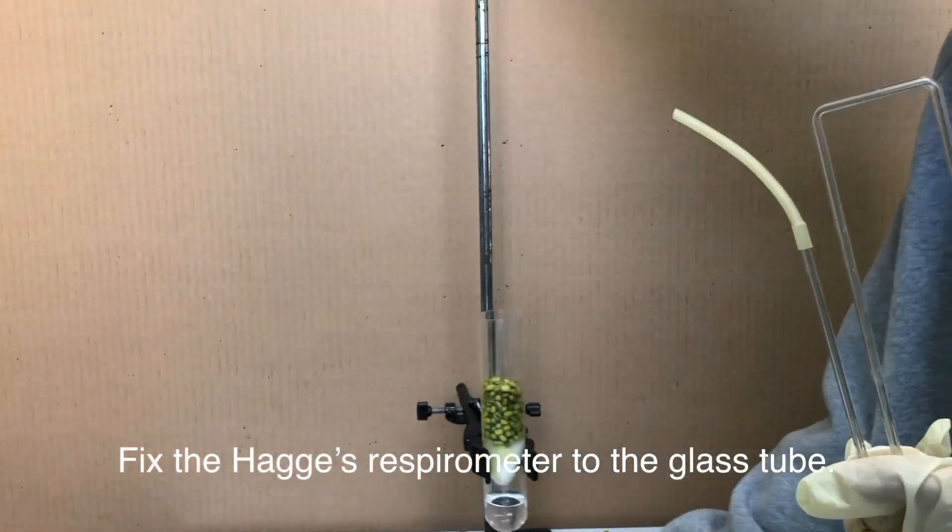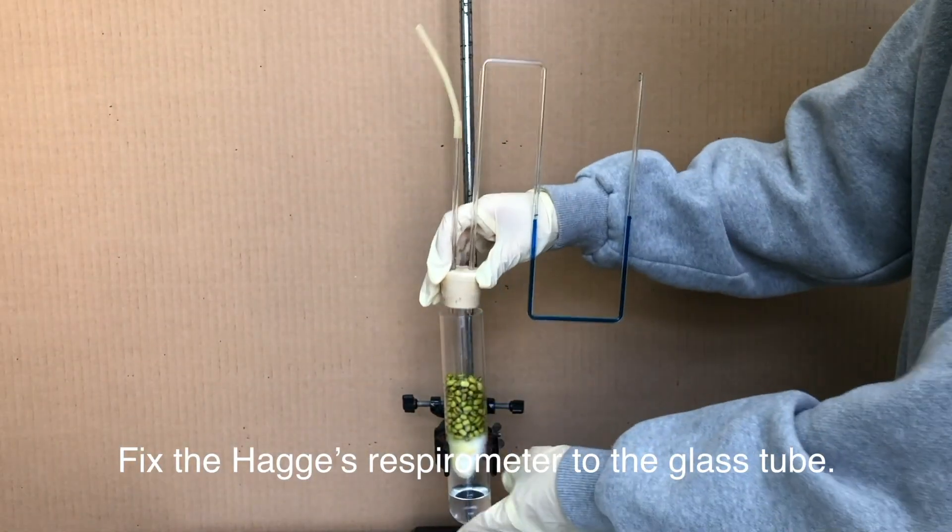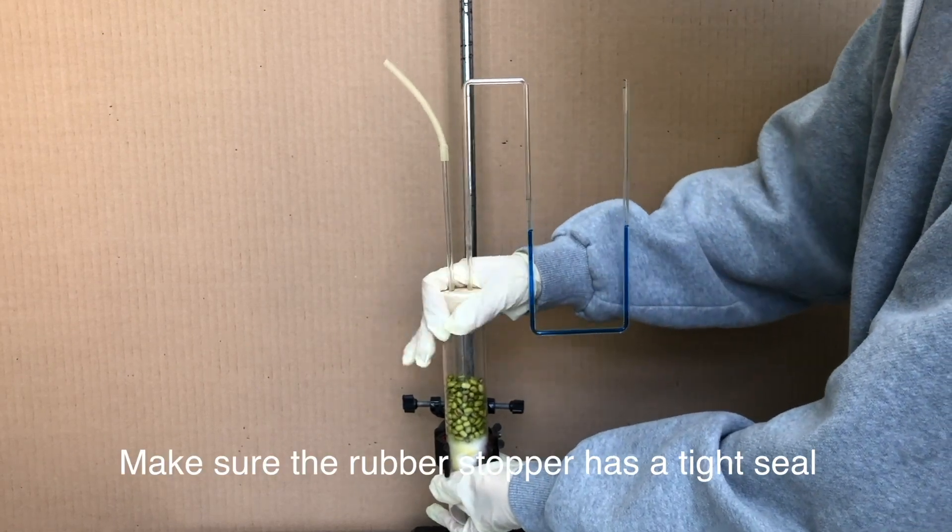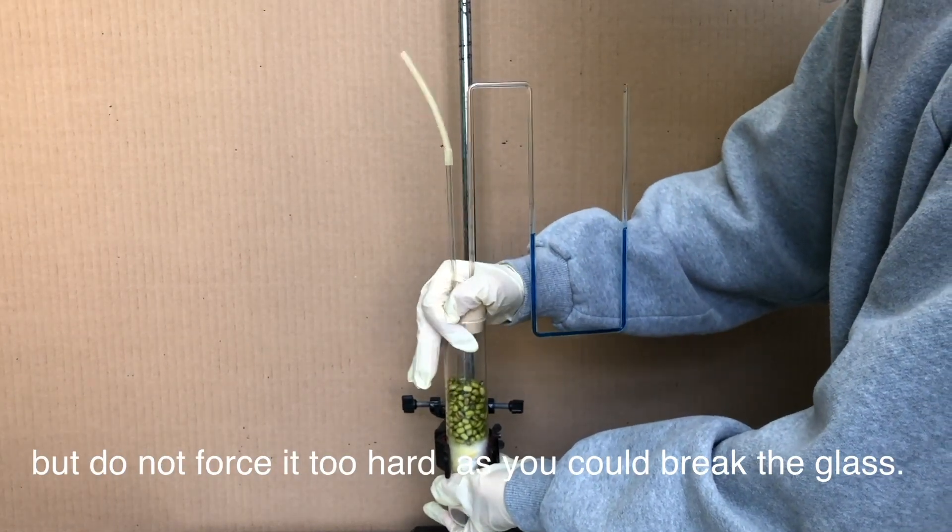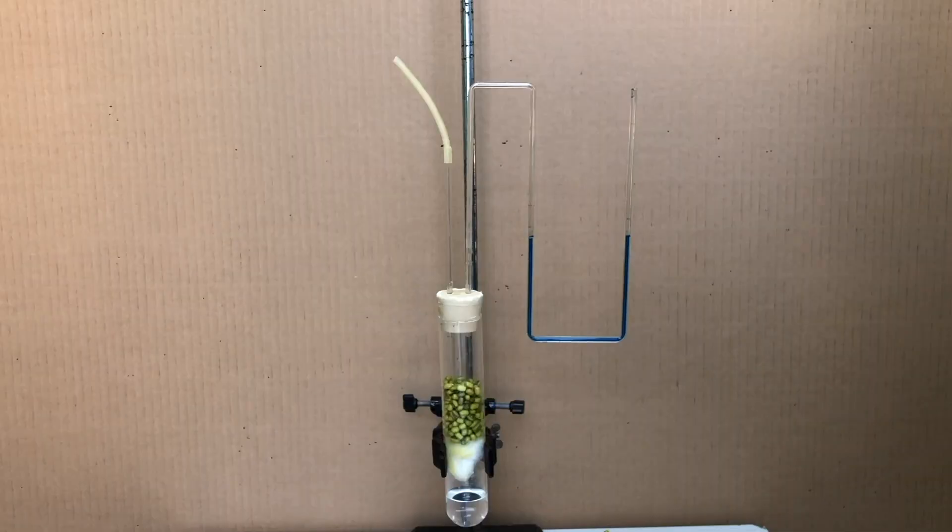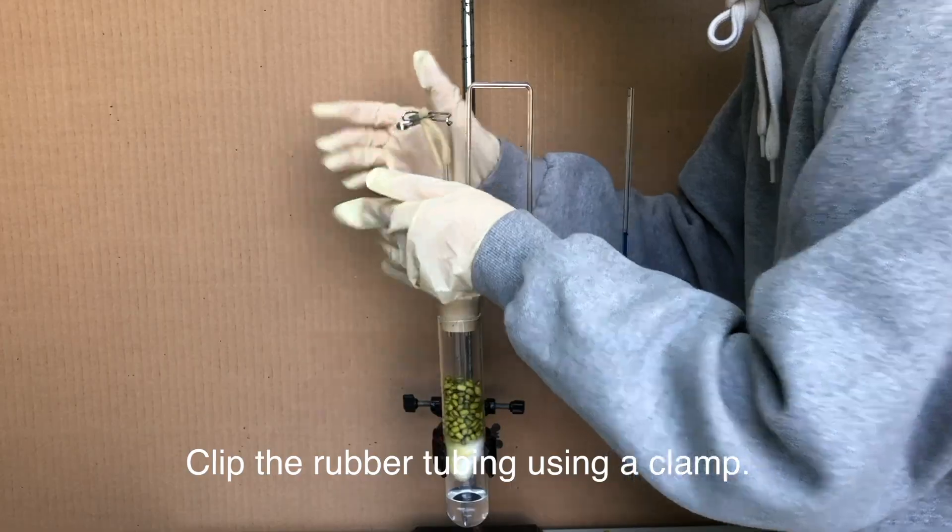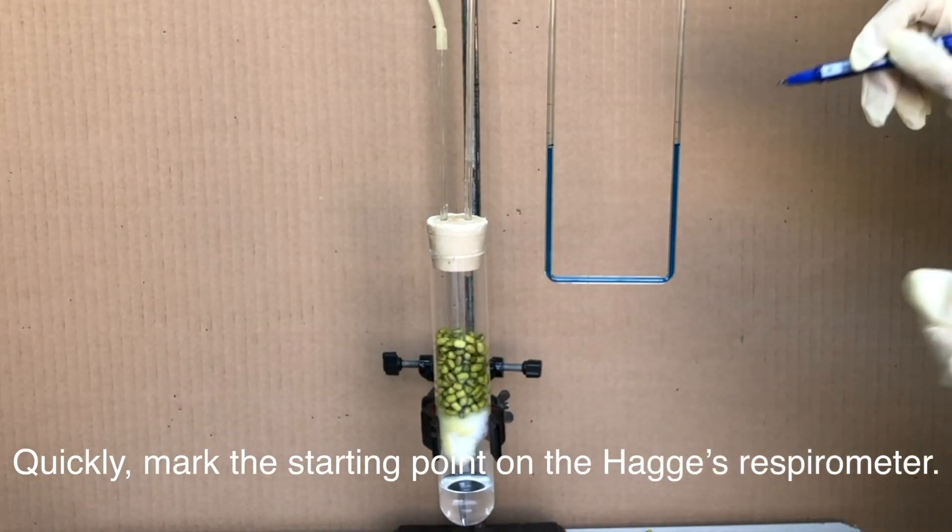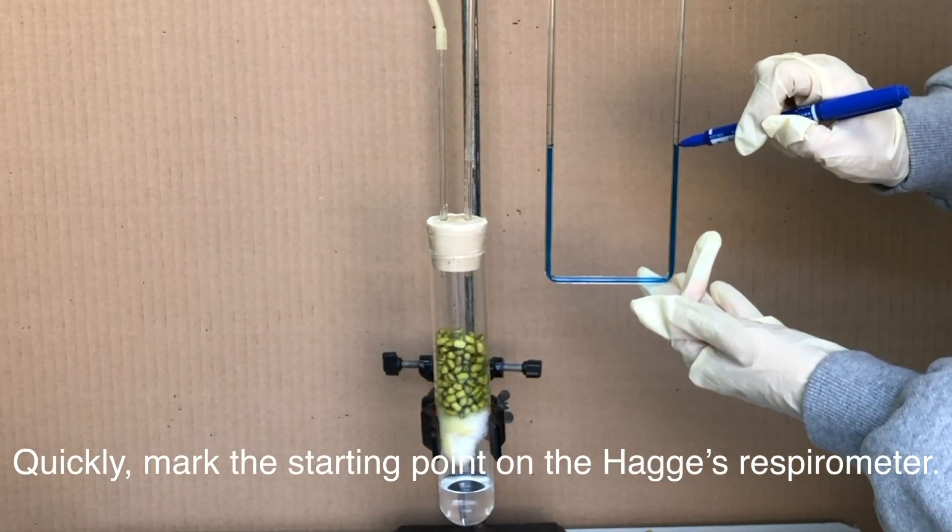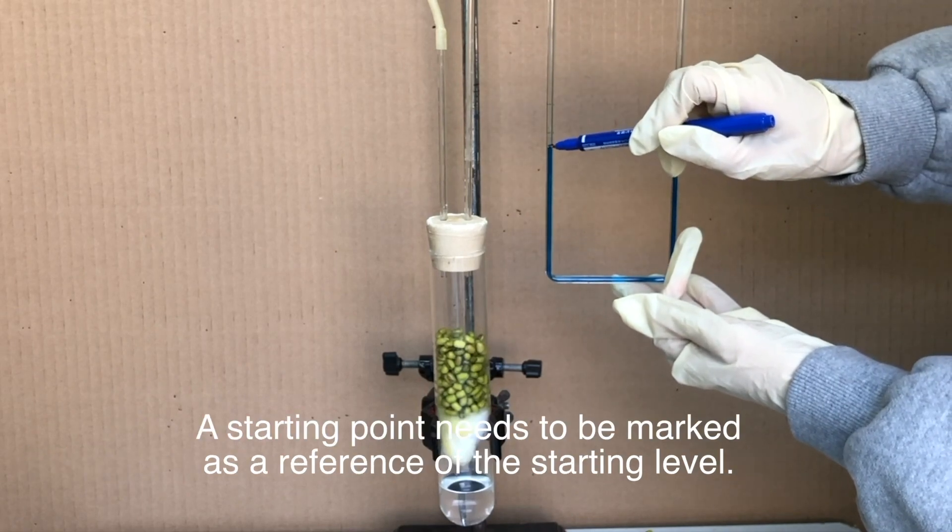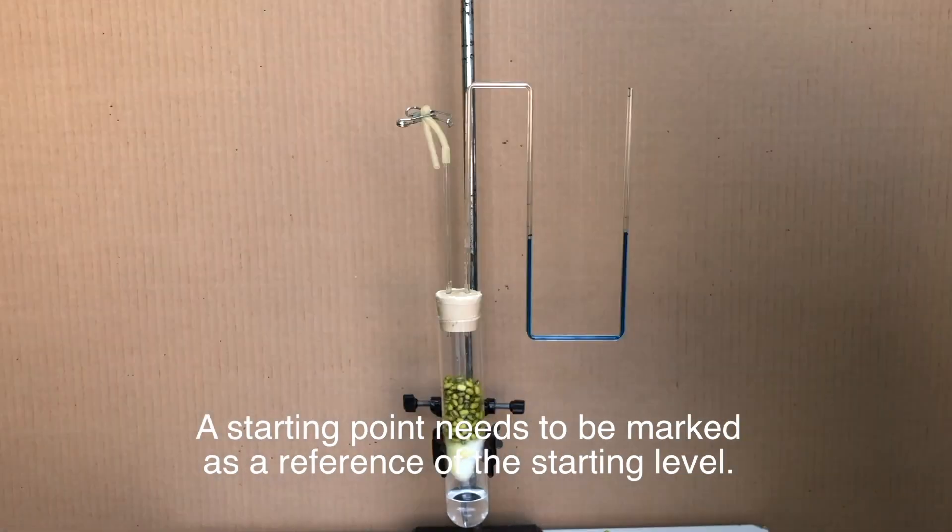Fix the Hagge's respirometer to the glass tube. Make sure the rubber stopper has a tight seal, but do not force it too hard as you could break the glass. Clip the rubber tubing using a clamp. Quickly, mark the starting point on the Hagge's respirometer. A starting point needs to be marked as a reference of the starting level.